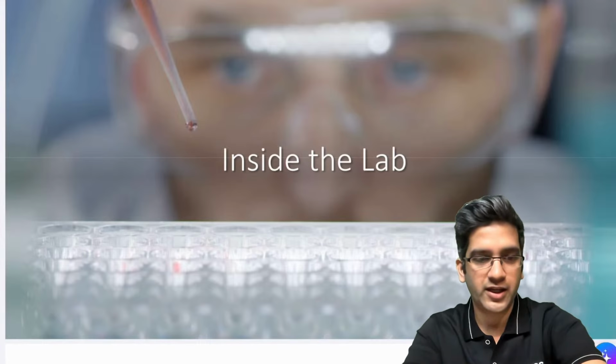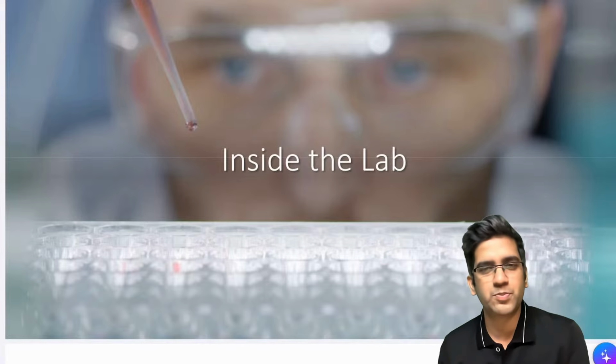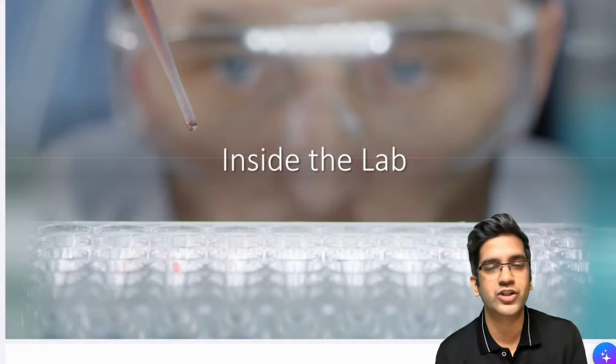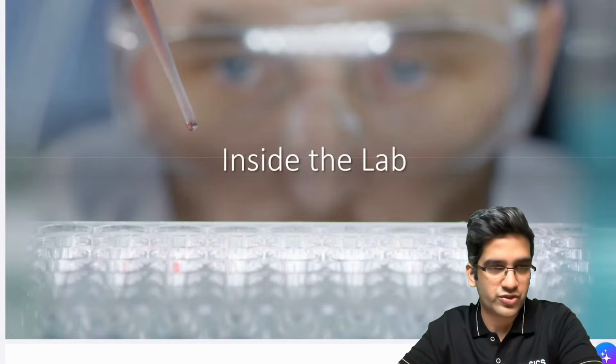Yes. Okay, let's start. So we are back to the same series. We are looking at what's happening inside the lab. We had a couple of sessions before. We had a look at normal light microscopy, fluorescent microscopy, and also a little bit of frozen section yesterday, right? So I'm going to take it forward today. As you can see from the name, we're going to look at fixation and processing, right?